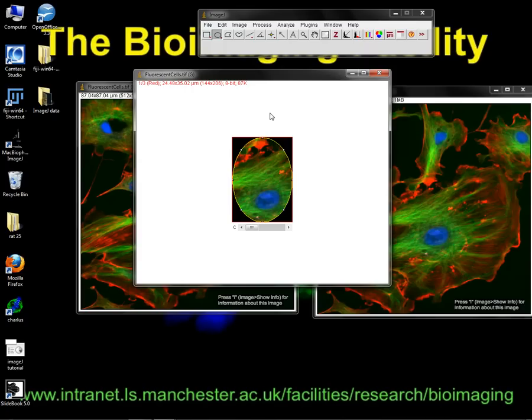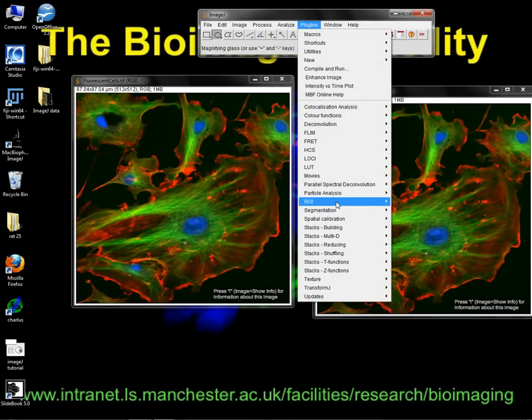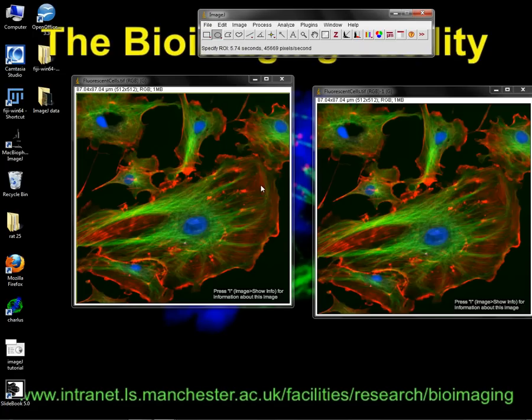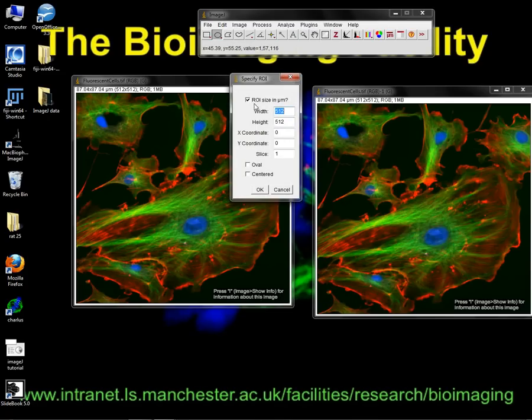Yeah, question at the back. Let's say 300 by 300, to specify. Yeah. A region of interest, absolutely. So if you go to this tool, it's one of the plugins, ROI, Specify ROI. So you want it to be 300 by 300? Okay. Why is that not saying that should work? Specify ROI. ROI in microns, no. Let's do it in pixels. 500 to 300 by 300. There you go.